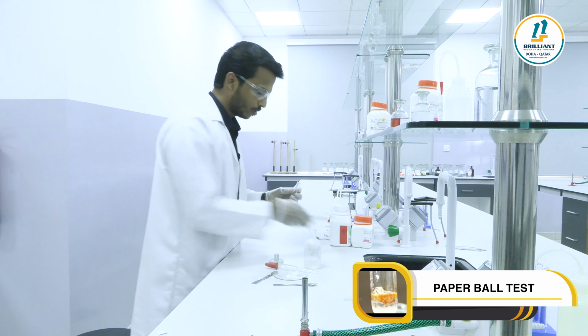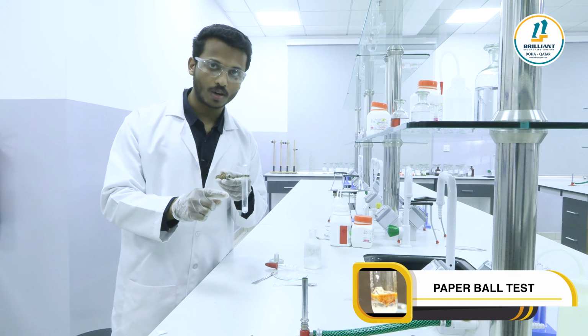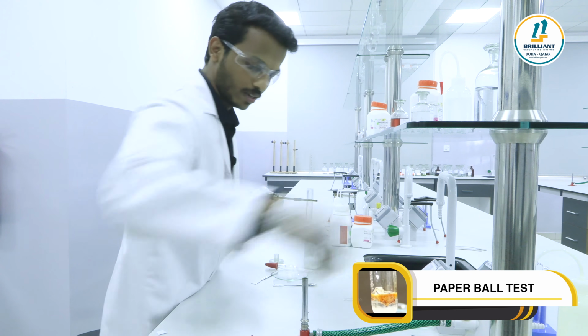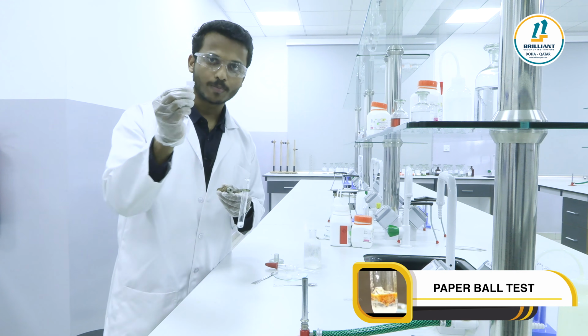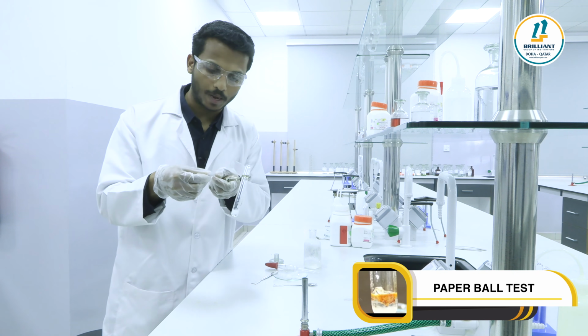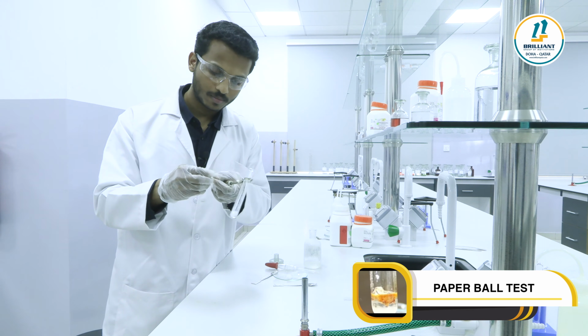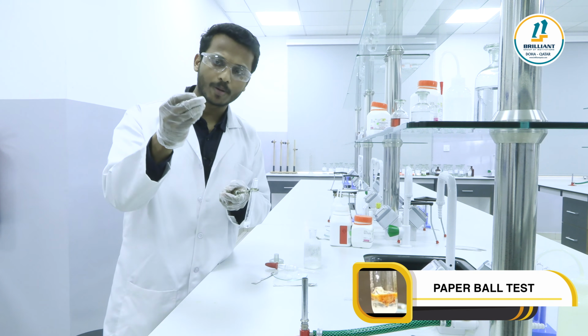Then we have to heat the test tube. So the salt with the concentrated H2SO4, then heat the test tube. Before that, you should be ready with a small piece of paper. Make this paper into a ball. This is called the paper ball test.